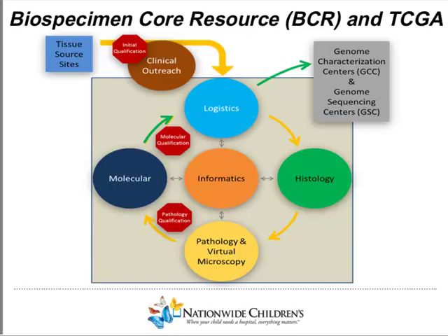And so again, up here we have tissue source sites from around the world submitting samples for consideration. And there's a clinical data group that does the initial review of those samples to make sure they meet the eligibility requirements for the study.